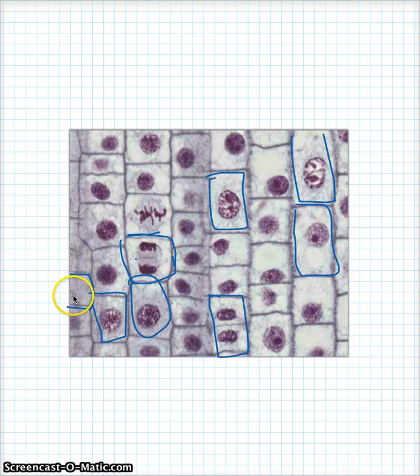Mainly because I don't see the nucleus. Remember, we're looking at a cross-section, a cut through some tissue. So, maybe we left the nucleus on the other piece that we didn't put on the slide.